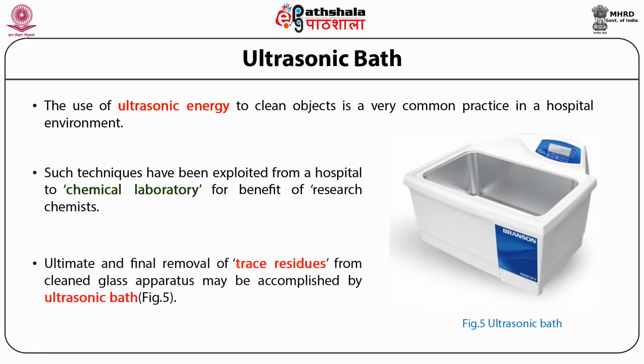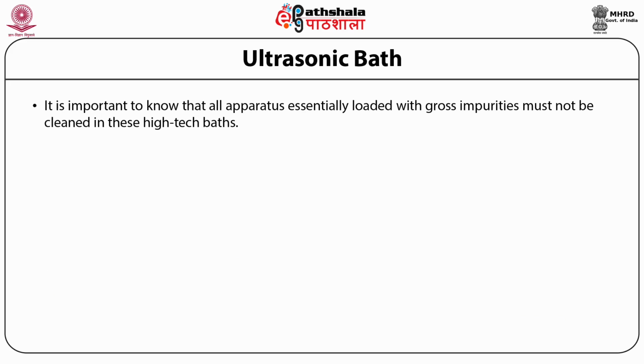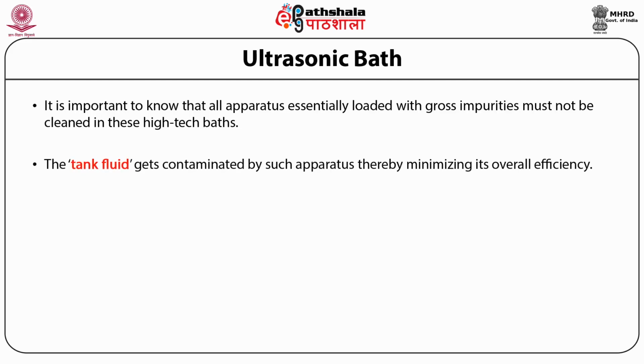The ultimate and final removal of trace residues from previously treated and cleaned glass apparatus may be accomplished by ultrasonic bath. It is important to know that all apparatus essentially loaded with gross impurities must not be cleaned in these high-tech baths, because the tank fluid shall become contaminated, thereby minimizing its overall efficiency to a significant extent.